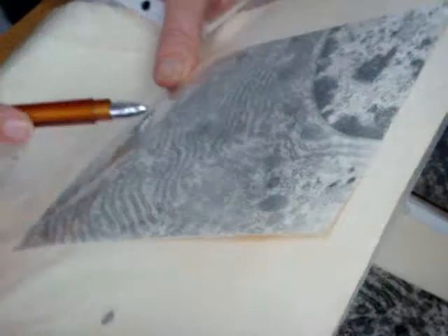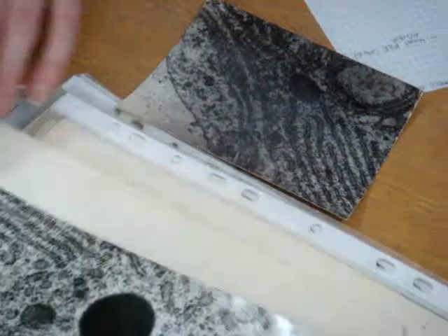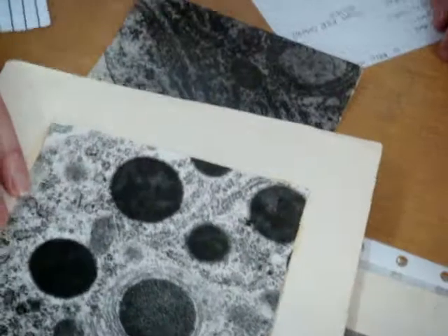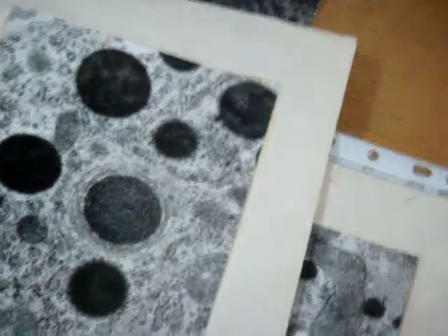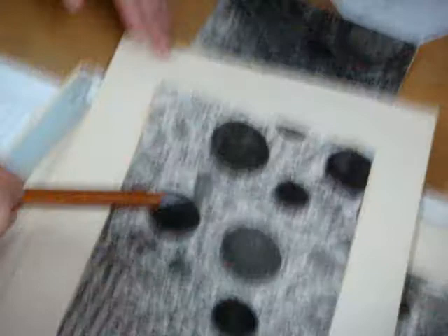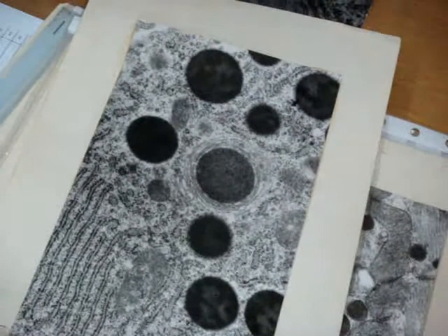What's this? These are mitochondria, not good, small magnification, not a good section, oblique, so it's difficult. Okay, what is it? We can't see the cell membrane, this is part of one cell, yes? Let's look at the organelles. Rough endoplasmic reticulum a lot, mitochondria, secretory granules. So probably this is an epithelial cell, glandular epithelium again.